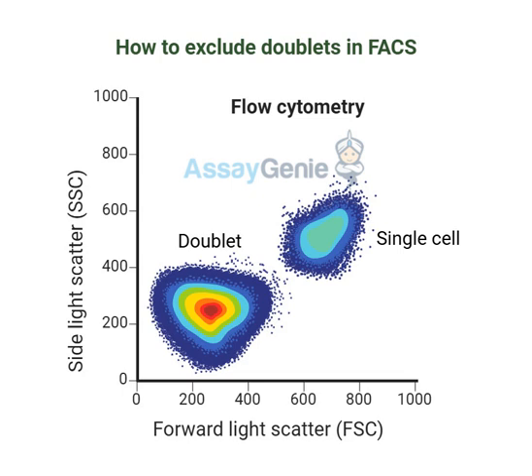It's pretty amazing. Okay, picture this. Imagine shining your flashlight on a cell again. The area is like the overall shape of the shadow it casts. The height is like measuring how tall the cell is at its tallest point. And the width is like measuring how long it takes the cell to completely pass through the beam of light. So they're basically measuring how long it takes for the cell to cross the laser beam's path. That's a great way to put it.